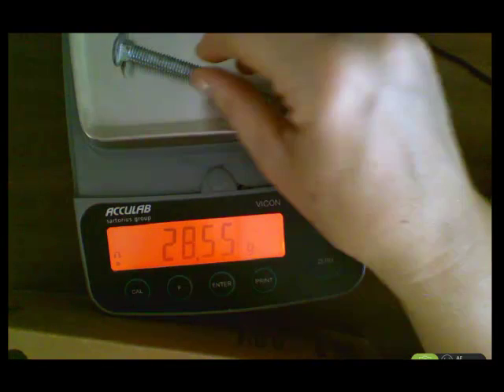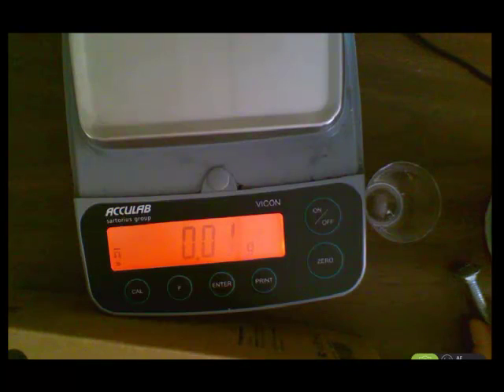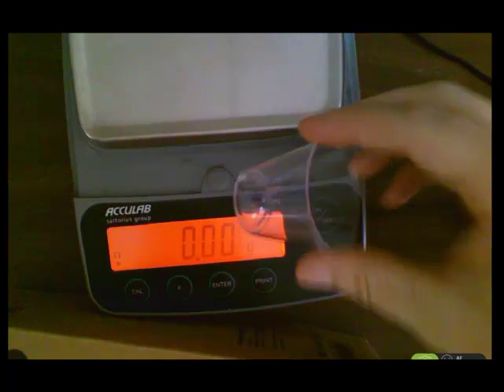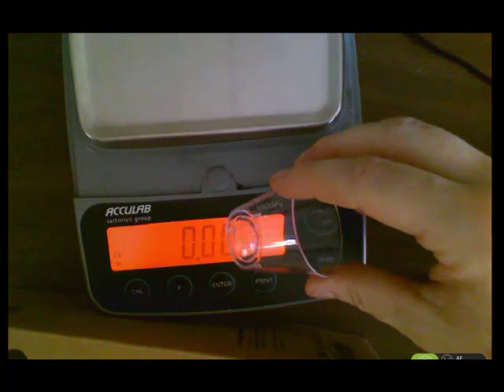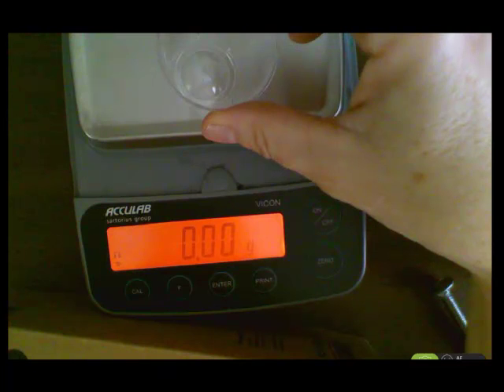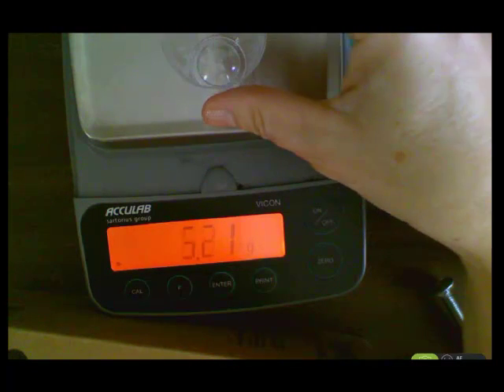Now let's say you wanted to measure the mass of something like salt. You can't pour the salt right on the pan. You have to put it in some kind of container. And you don't want the mass of the container. Now these balances have a very nice feature, and it's called the Tare button, T-A-R-E. And on this particular balance, it's called the 0 button.